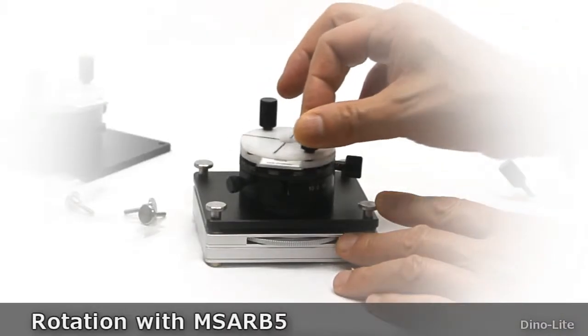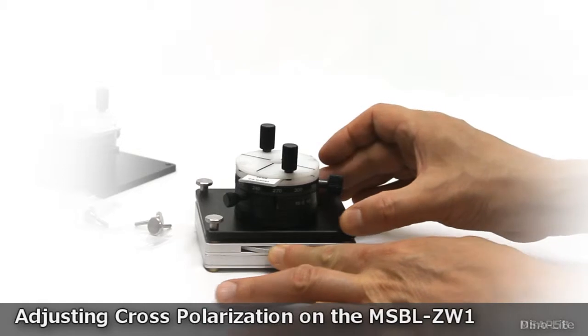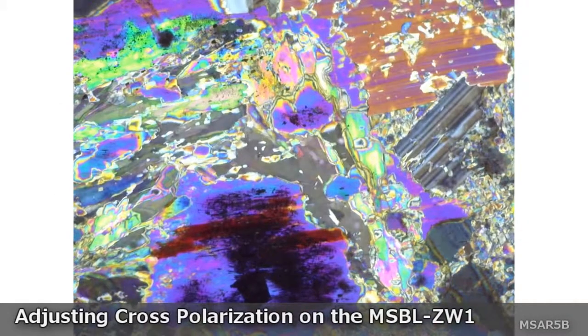Rotation of the slide is performed from the top, and turning the dial on the MS-BL-ZW1 can be used to adjust polarization.